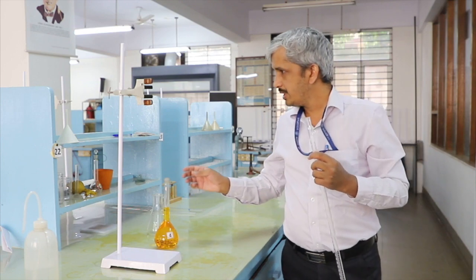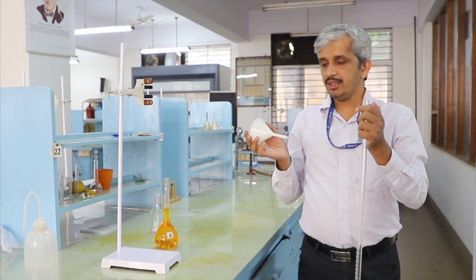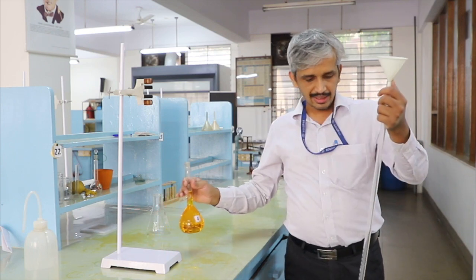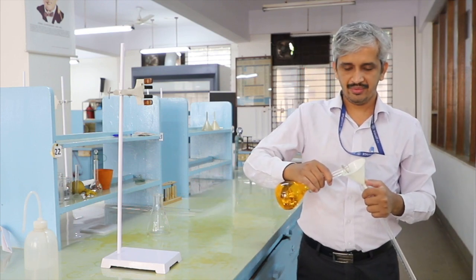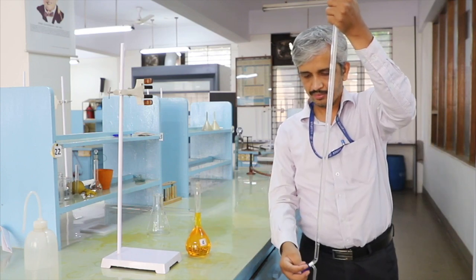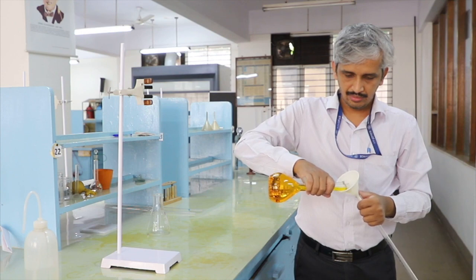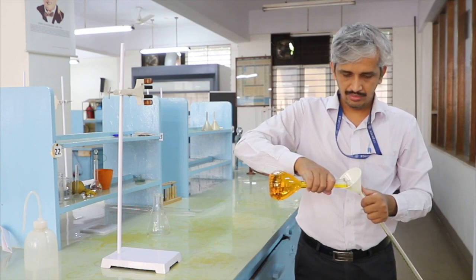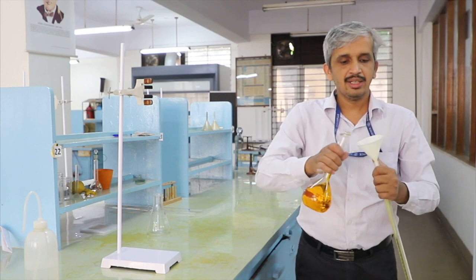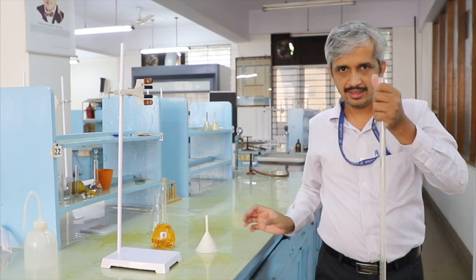In case of burette, it should be rinsed with the solution to be taken. And while filling the burette, you cannot directly fill. You can use a funnel like this. And while rinsing, you should also rinse the funnel. So I am rinsing both the funnel as well as the burette now. The funnel is also rinsed. Now the burette should be rinsed.